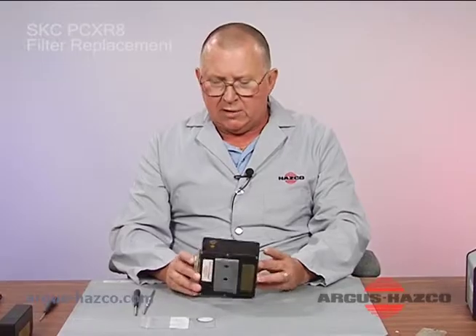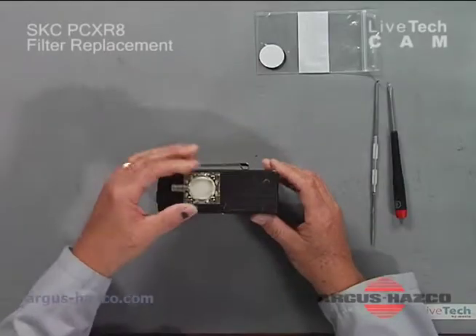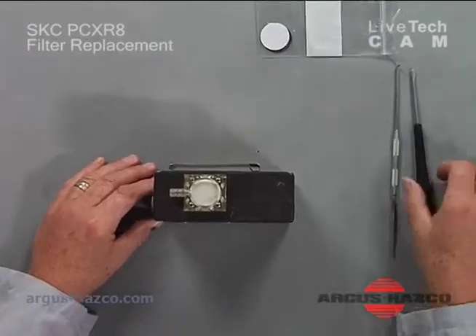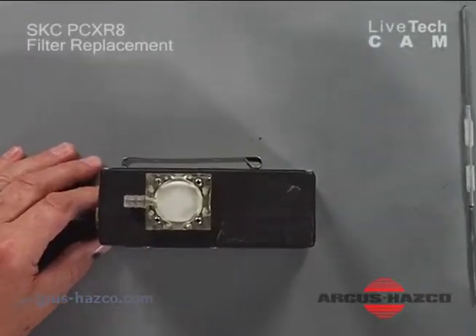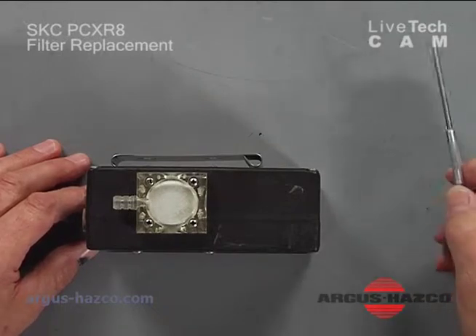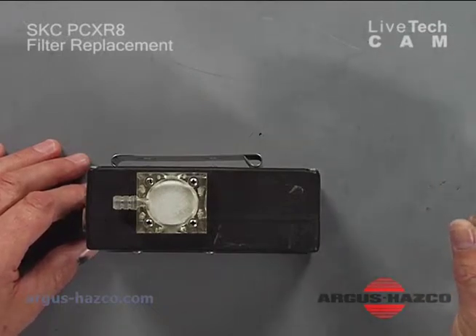The first thing you will do is take your pump and locate the filter housing. For this you will need a small Phillips screwdriver and a small flat screwdriver or a pick of some kind to get the filter out.